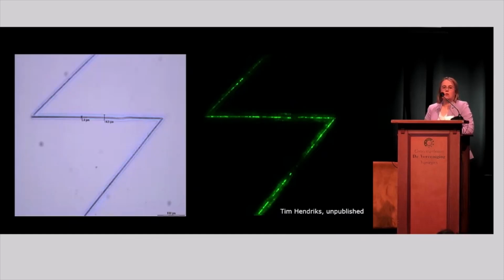At the moment, in the glass slide where we put the tissue section on afterwards, we engrave different signs with a laser, and we fill these little gaps with a mass and a fluorescent stained marker. So we can see the mass in the MSI results, and we can see the fluorescence from the same slide on the fluorescence imaging. The thickness of this is about 6 micrometers. We can go even lower. Of course, if we go too low, we cannot see it anymore in the MSI.